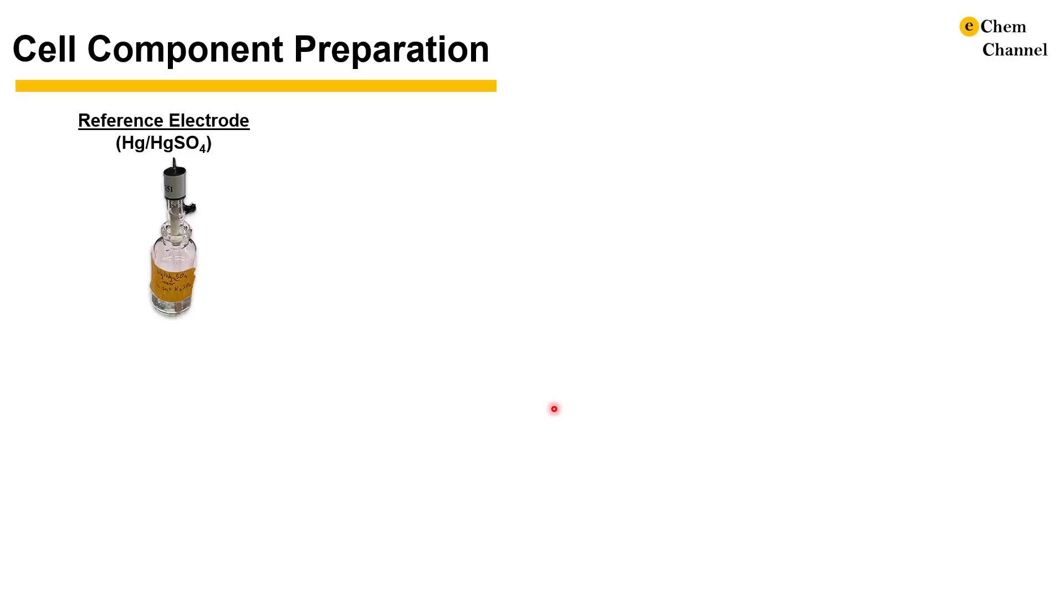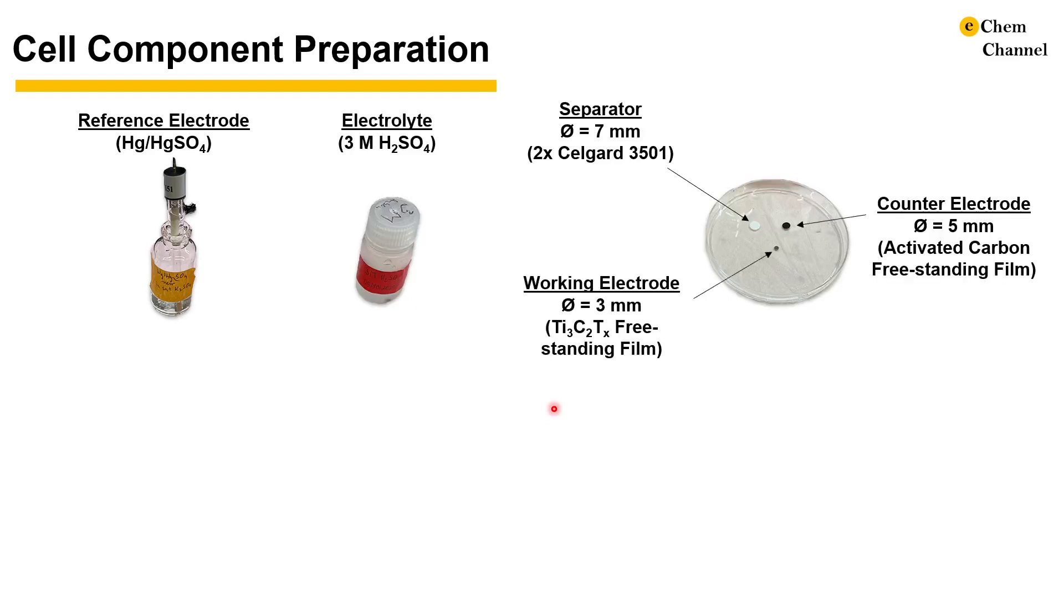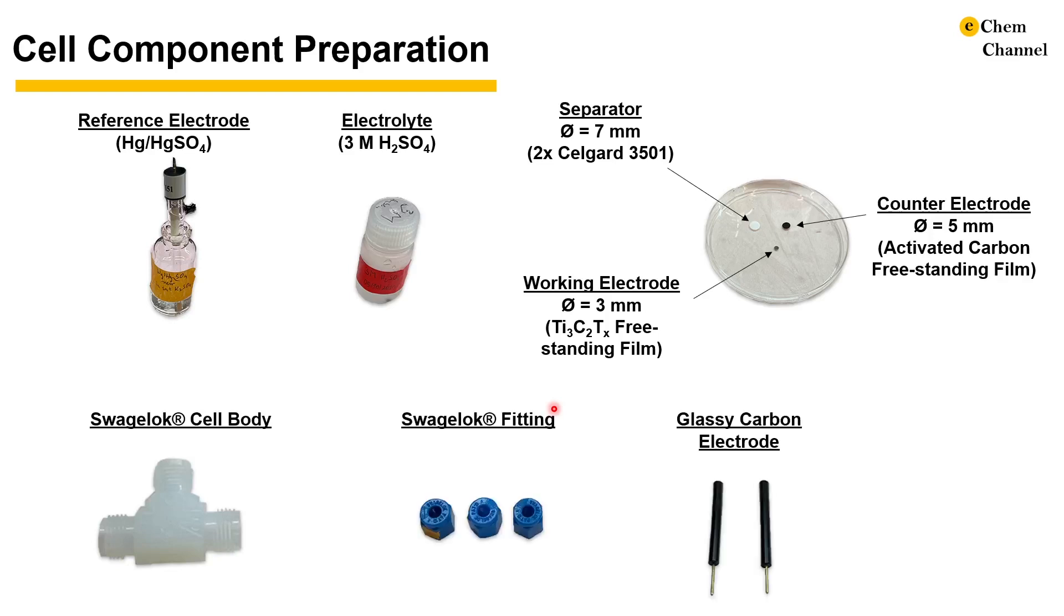For this experiment, we need the following chemicals and components prepared before the assembly. A reference electrode, a bottle of electrolyte, pieces of separators, a counter electrode, a working electrode, the swagelok cell body and fittings, glassy carbon electrodes that serve as the current collectors and gaskets to prevent leakage. There are a few consumables like pipettes and kimwipes that are not shown here but should be prepared as well. The specific components used in the following demonstration are listed in the parentheses.